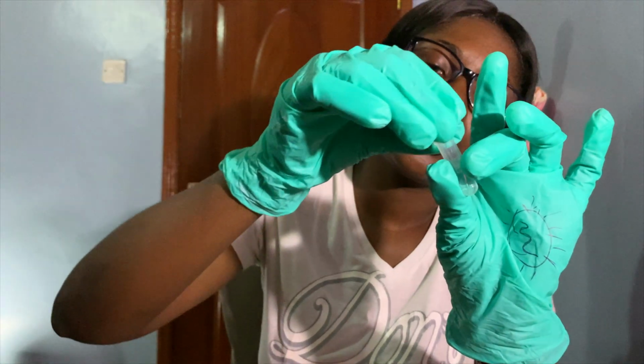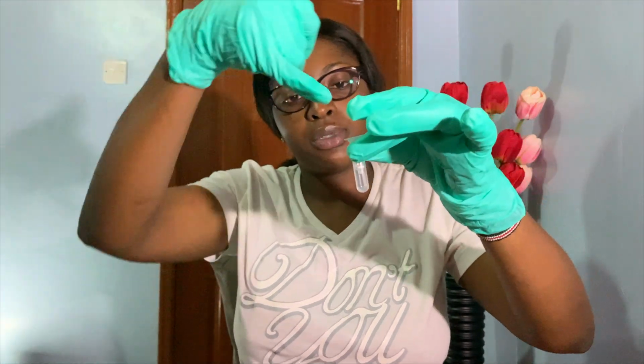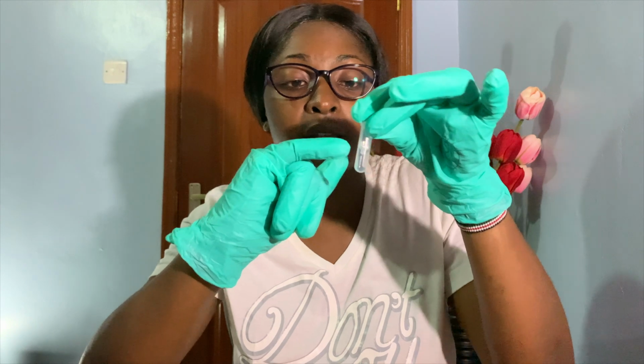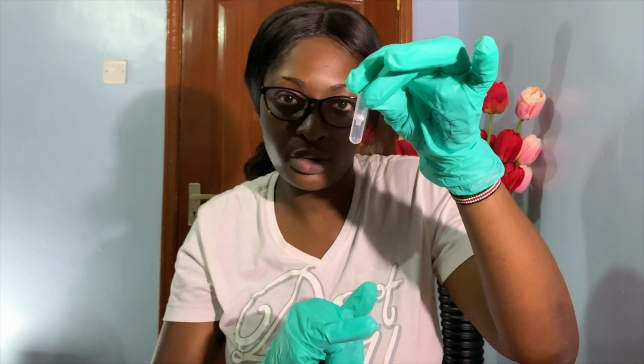When you put it like this, we centrifuge the fluid that was in that tiny tube you put in here. The fluid is going to pass down, but whatever remains will be your RNA, captured in here. It will not sieve through. With that, we then do what we call washes.